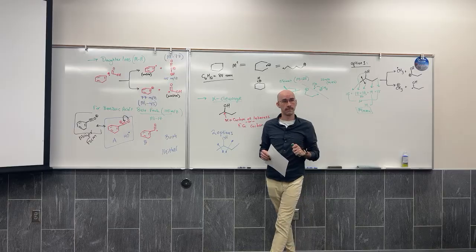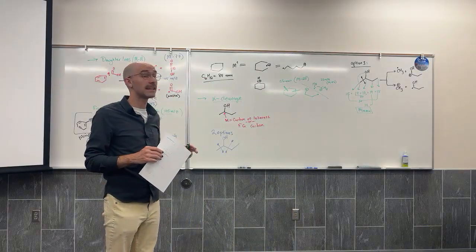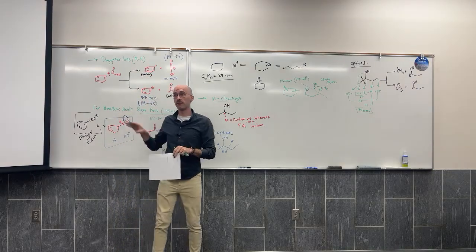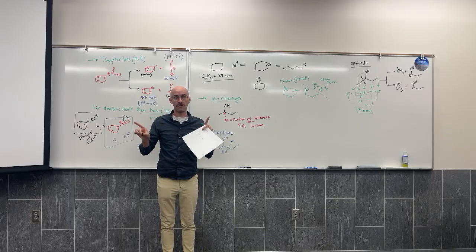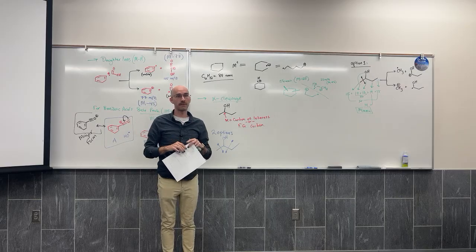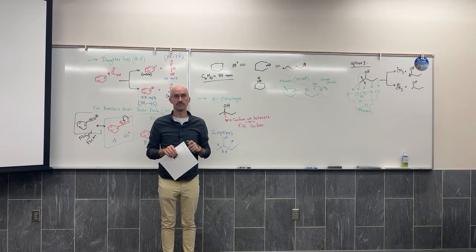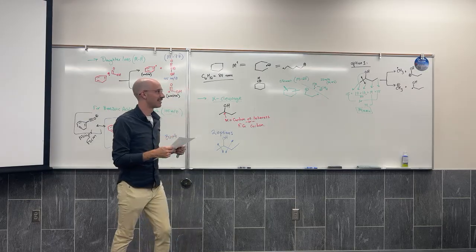And sorry, just one question. So with the numbers, it's just going off atomic mass, correct? Yes. Okay, sweet. So we're not weighing this on a scale. No. We're using a magnet to bring it to a detector. So we're using the math of the magnetic field strength against mass of the fragment. So it is calculating it in atomic mass units. So we don't have a full number set, then you're just pulling off the periodic table. We're going to talk about that. Pull them off the periodic table versus pull them out of thin air. I'll answer that in a minute.